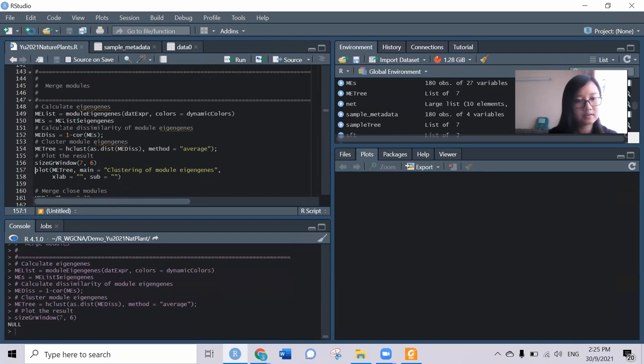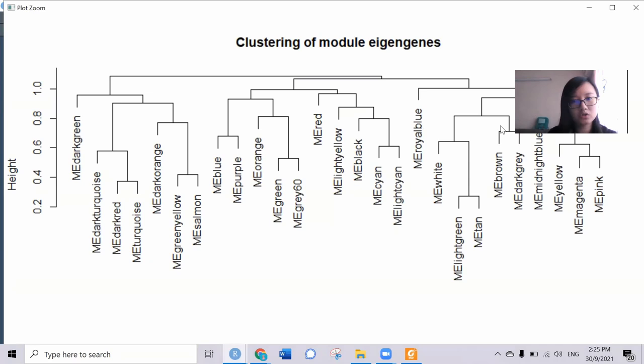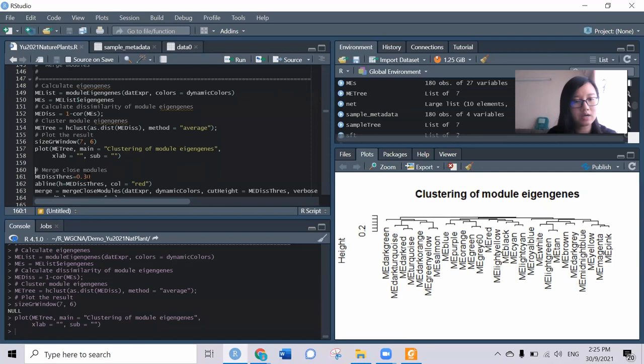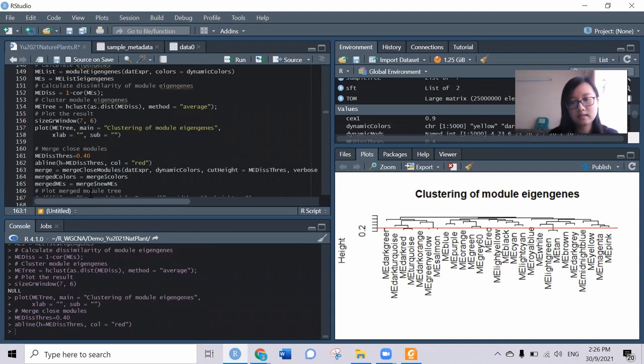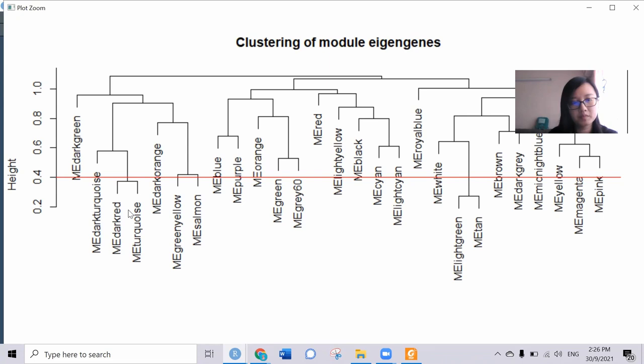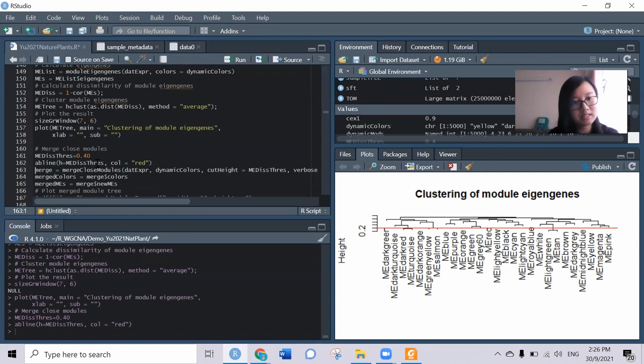We can see this is all the modules generated by the step-by-step method. Some of the modules we can try to merge. Let's say I want to merge something like this. I want to put the line here at 4. It will be having something like this - these two will merge together and these two will merge together. This looks quite okay for my data. That means you can flexibly adjust the threshold of the merge cut height.